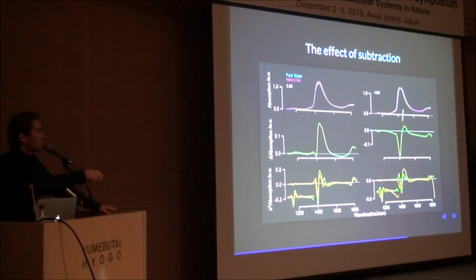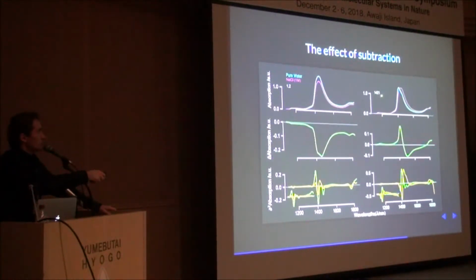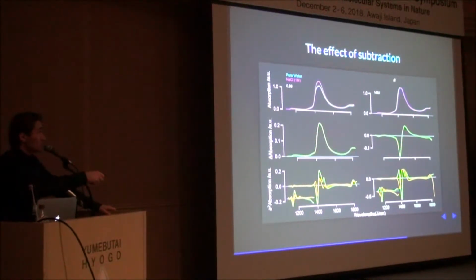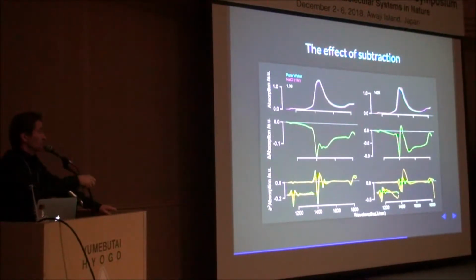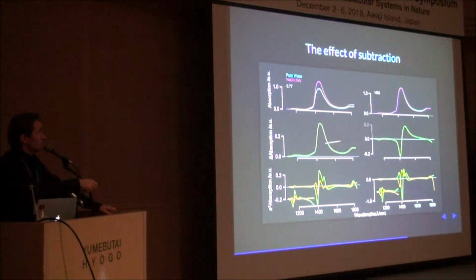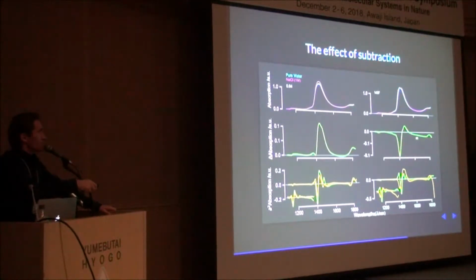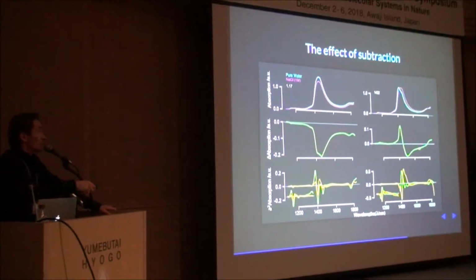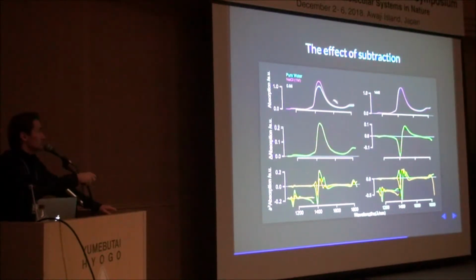On this right side, this is the wavelength of the water. We're here at hot water, and it's slowly moving to the right, to cold water. So here we're observing what happens if we change the wavelength position of the water spectrum that we're subtracting. And you can see that they are very, very different. These are very similar, except that the effect of wavelength difference is much, much larger in scale, and it affects the outcome much more than the scaling. Both effects are important, but this one is larger and this is slightly secondary.